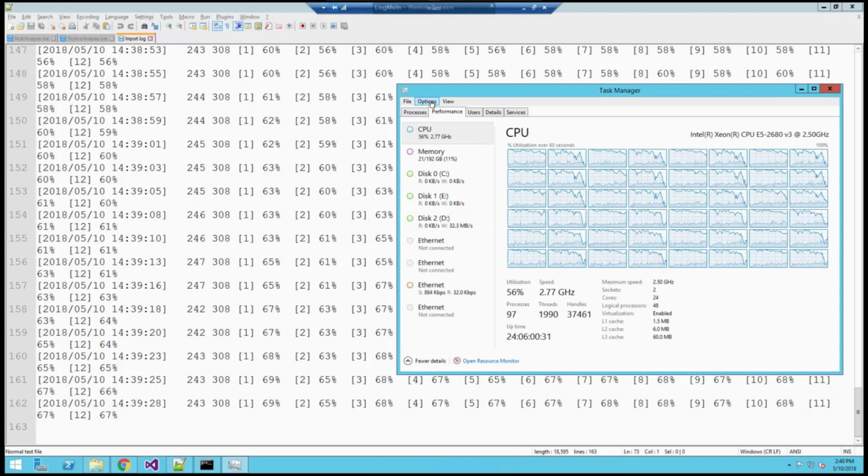If you want to do big scale DIA processing, you should definitely learn how to use these scripts and use the Skyline command line. Okay, we'll come back to that.